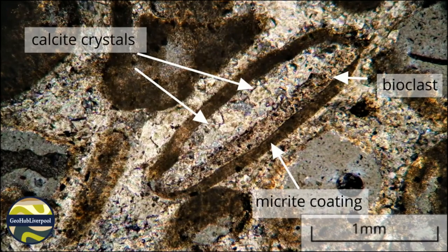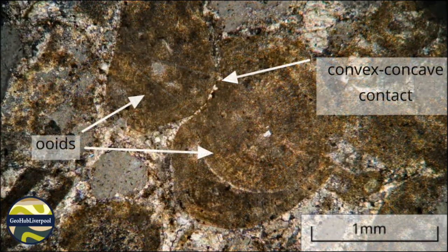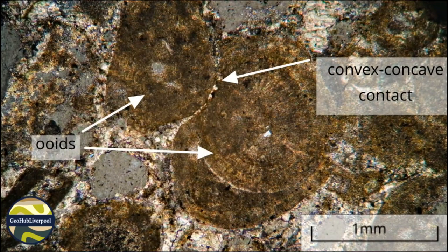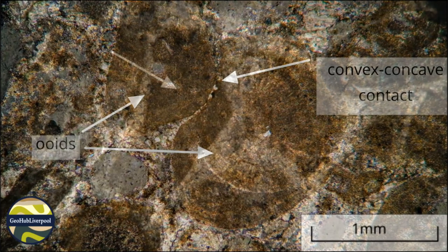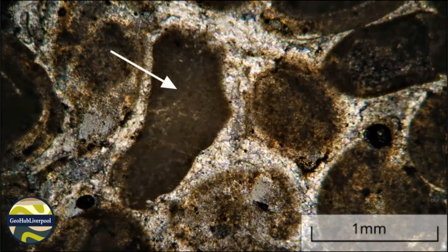These concave-convex contacts provide evidence that the ooids were compacted before they were cemented together. Some of the more irregular shaped masses of micrite show no internal structures and they may represent ripped-up fragments of carbonate mud.